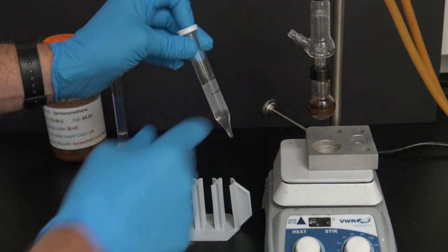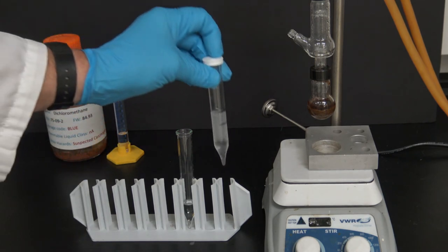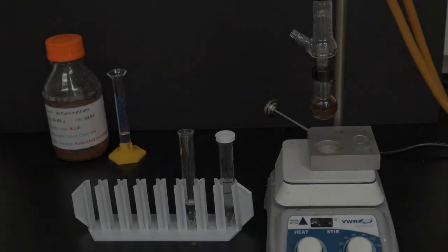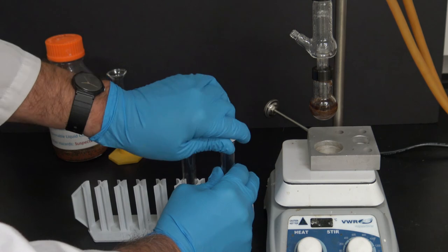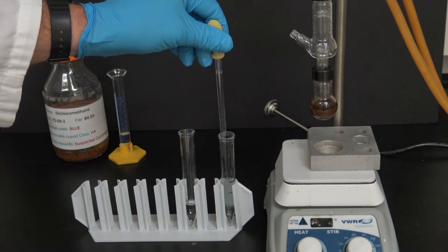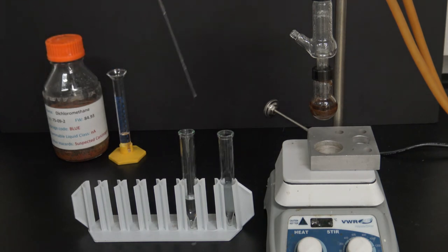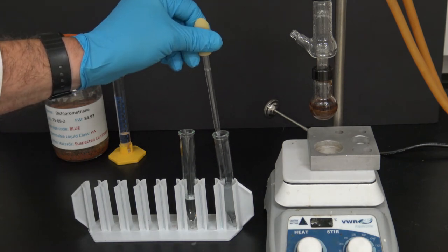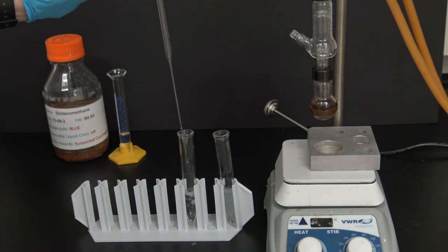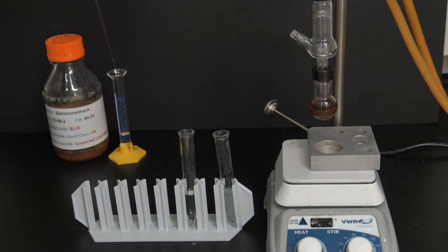Put my cap back on, mix those two layers up, and allow them to sit and separate for a while. Okay, those two layers have separated. I'm now going to remove my bottom methylene chloride layer. And now we're going to do it a third time. So I'm going to add some more methylene chloride.